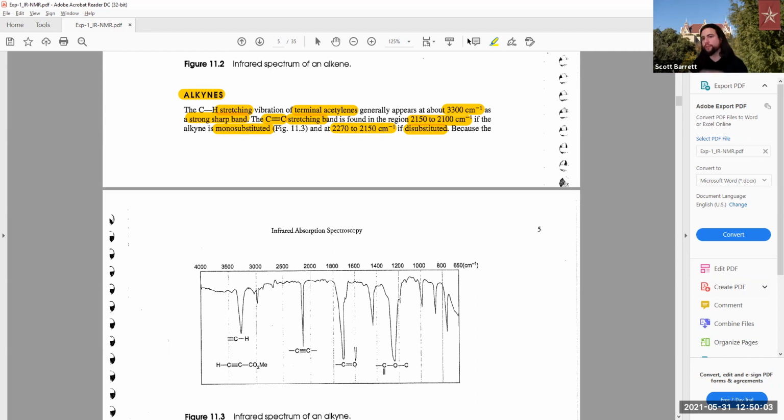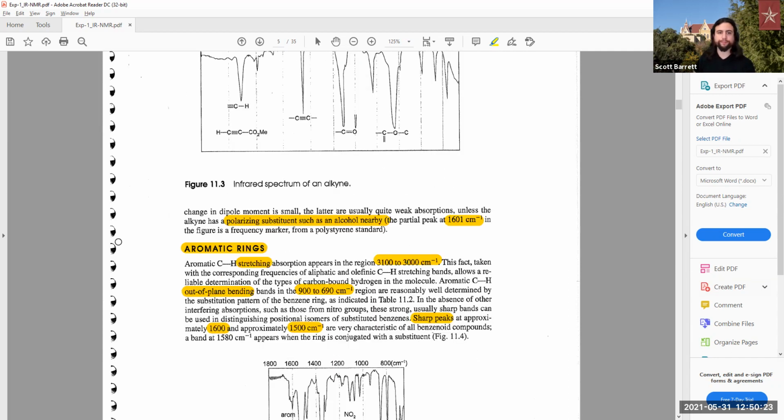But honestly, for alkynes, my personal go-to is near 3300 because that's pretty much next to and past the alcohol peak. Additionally, it's further than the alkene peak, as we spoke of before. And those are the specific things you want to memorize in your head, those unique numbers where you can find these functional groups.